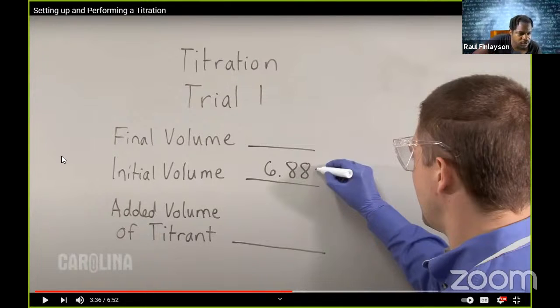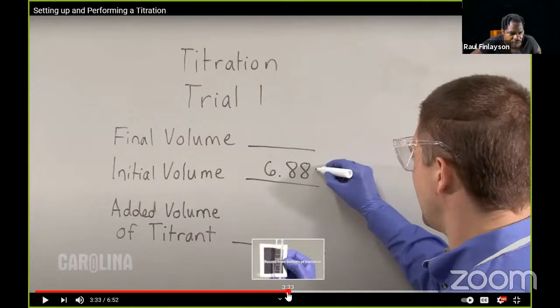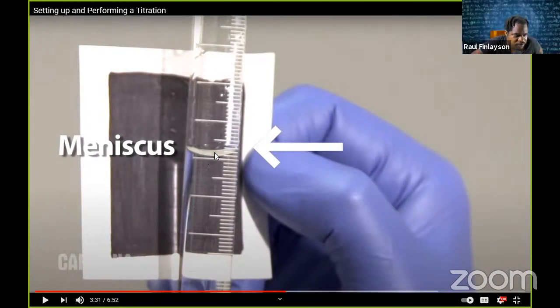And the next thing with the burette, guys, is that when you're measuring the volume, you read it twice. You read the initial volume, where you start, and as it said already, you read at the bottom of the meniscus. So even though the curve would come up to this number up here, we're going to read the number down here.